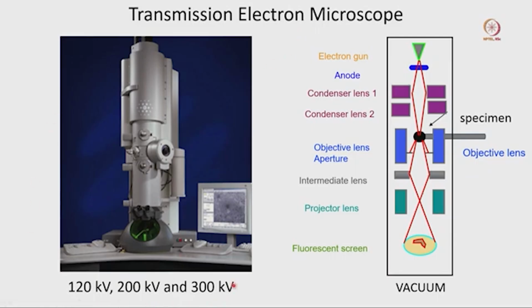So, this is a microscope that can easily operate at room temperature. We can prepare our biological sample at room temperature and image it. So, we do not need cryogenic temperature or conditions. Based on our criteria we can select our equipment.